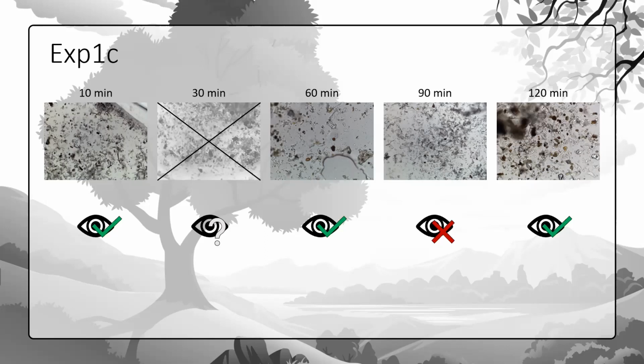And the funny thing is the 90 minutes sample was visually clean of myxos. 30 minutes I messed up. The sample is safe, but I forgot to look into it. And then, of course, what is the fun in just looking at the sample and seeing if there may be some myxos or myxo-like spores? I did a PCR with one of our SSU markers, to see if we can even find some gene markers of myxos to confirm basically what I saw.